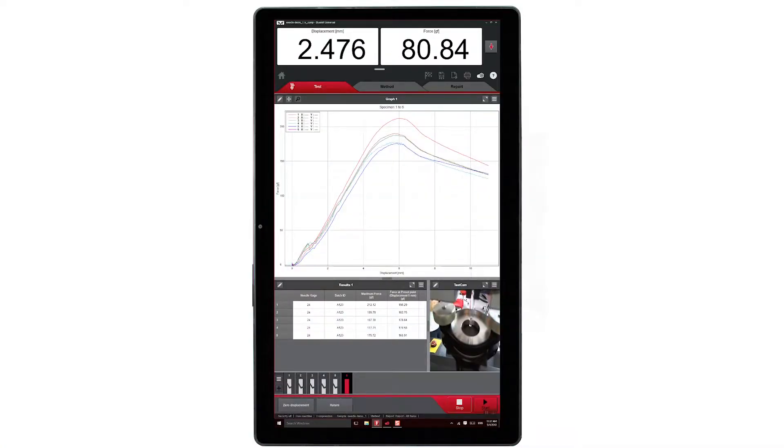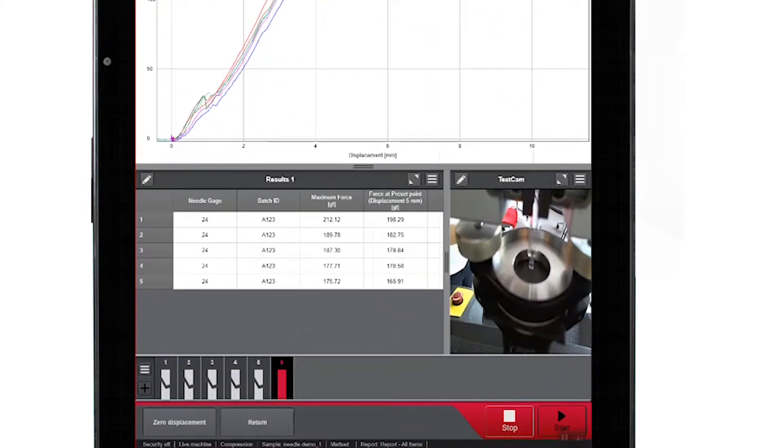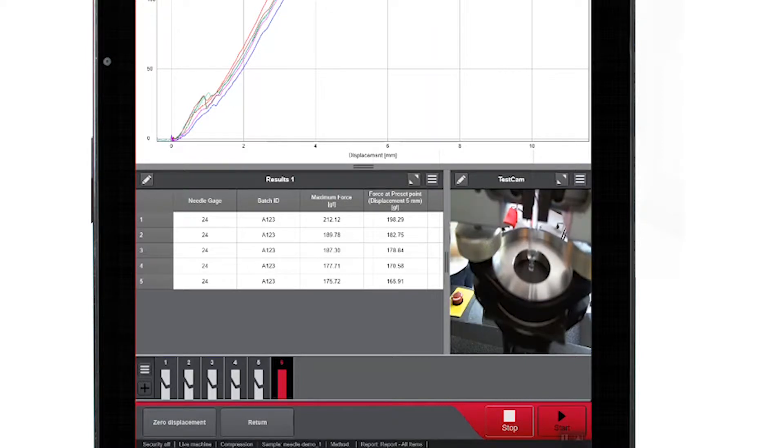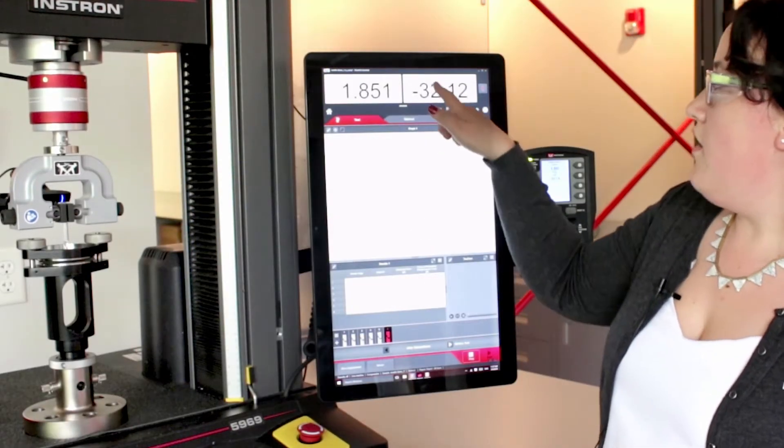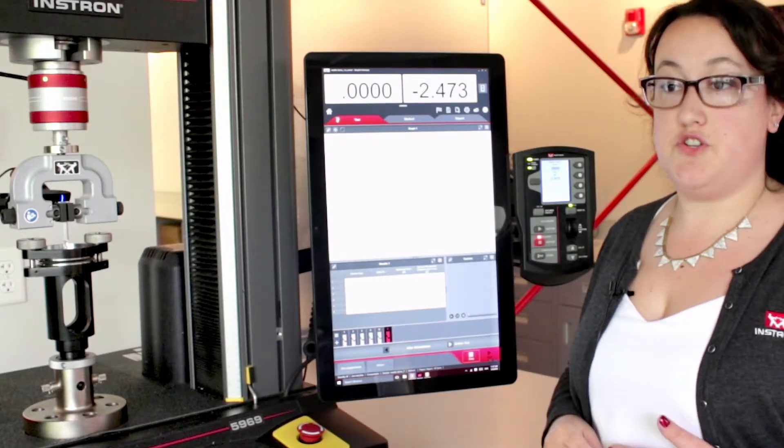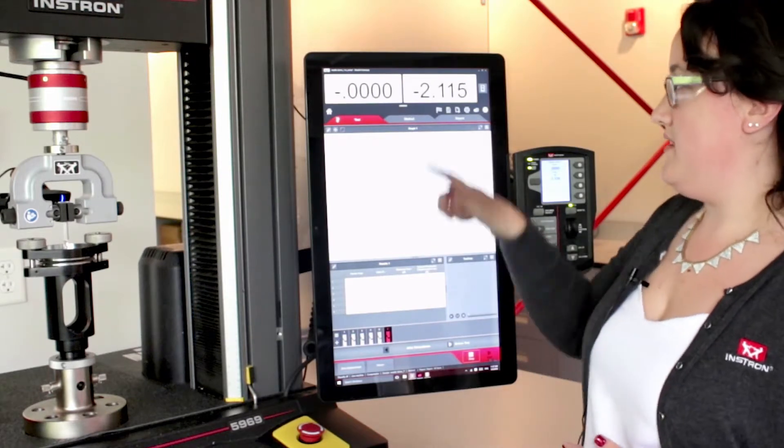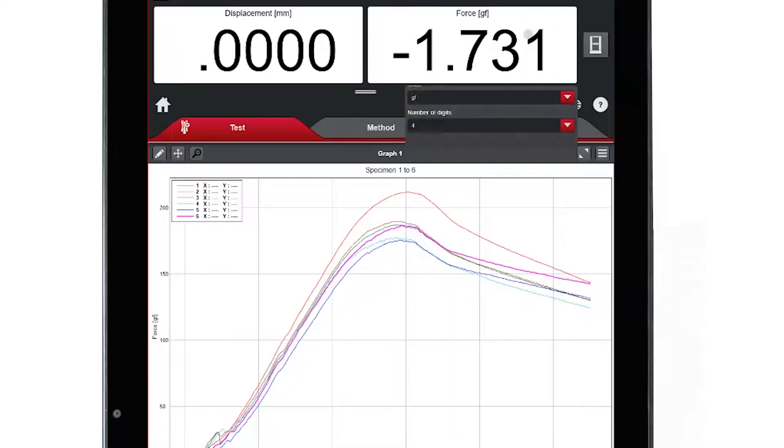It brings you to the workspace, where I have a live test cam set up. This records video of each specimen test so that I can refer back to that for later viewing. Across the graph, there are live displays which are totally customizable, depending on what you'd like to see.